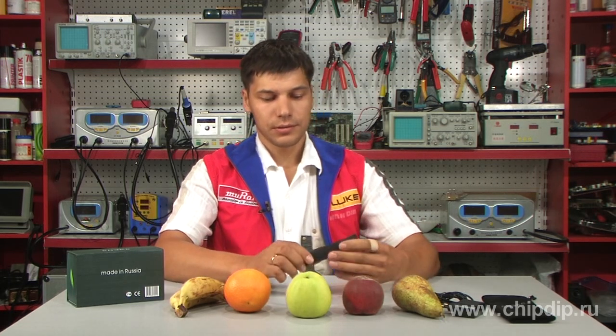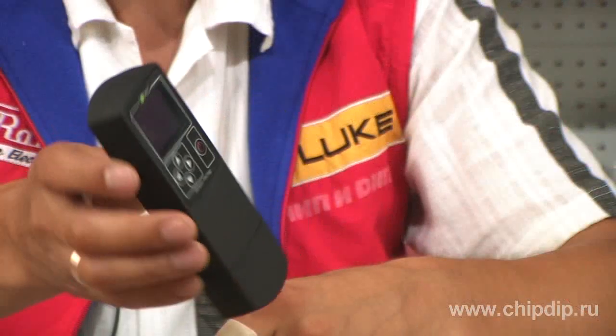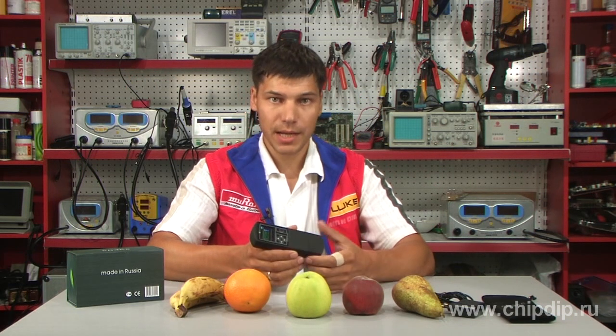The nitrate measuring instrument Soex intends to estimate the nitrate content in raw vegetables and fruits. The analysis is based on measuring the conductivity of high-frequency alternating current in tested products.